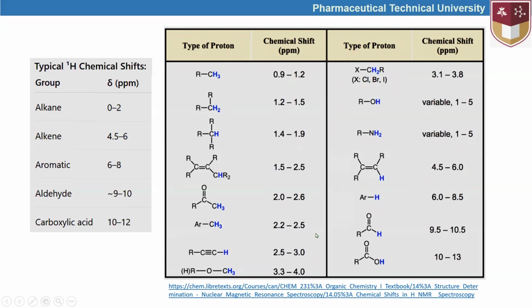Okay, these are the pointers, and I'm not going to explain all of them. The point that we have to understand, again, that can explain the shielding effect and electron density, is that the electron density of this hydrogen is higher, and the electron density of this hydrogen is smaller. The electrons of these two hydrogens are closer to the carbon atom in this case. So here higher frequency is required, and the chemical shift of this carbon is located between 6 and 8.5 or 8.